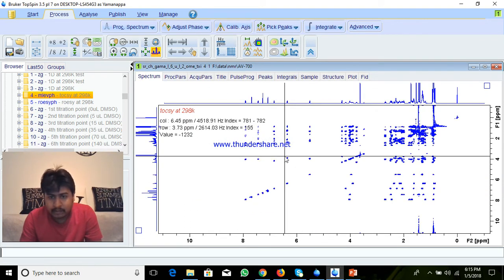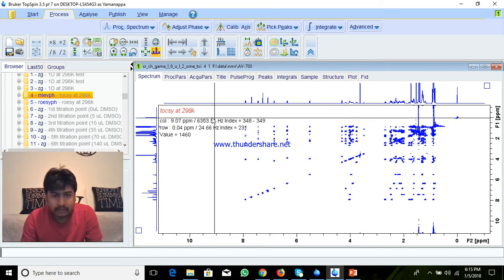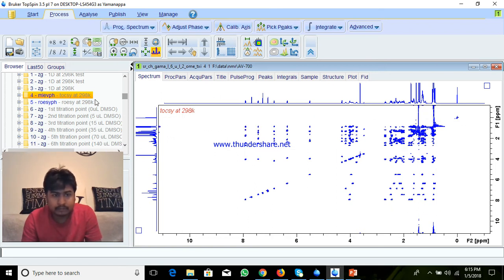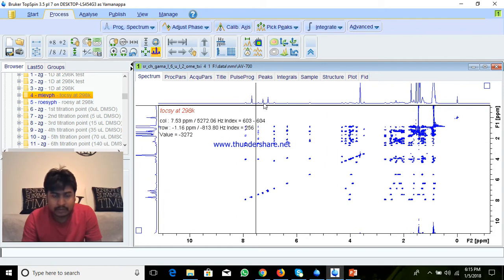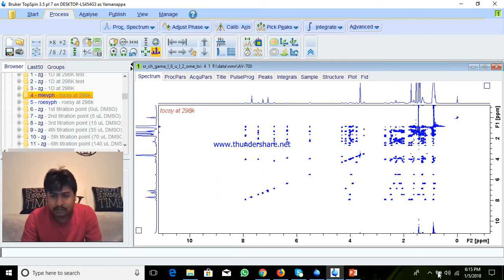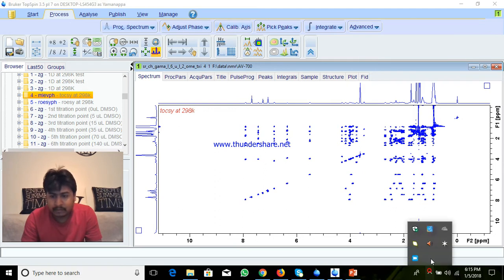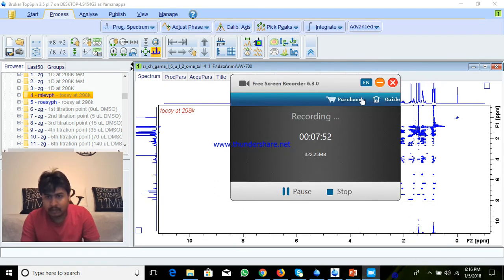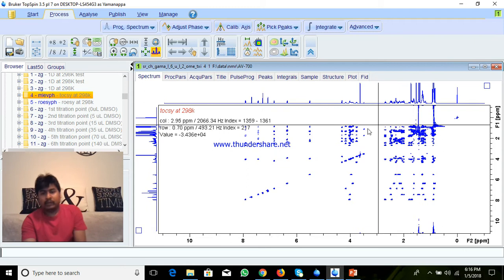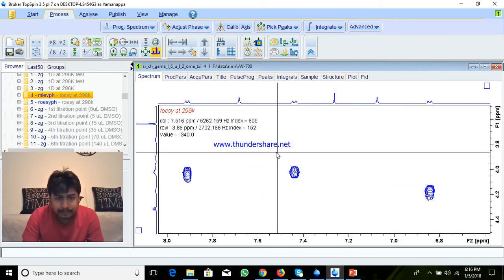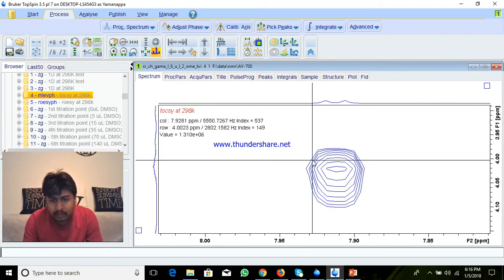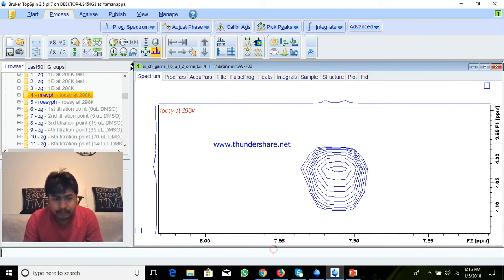So what I will do now: nlevel is 64. Actually, you can increase the number of levels — thickness means increase. I increase the number of levels — I think I forgot to increase.